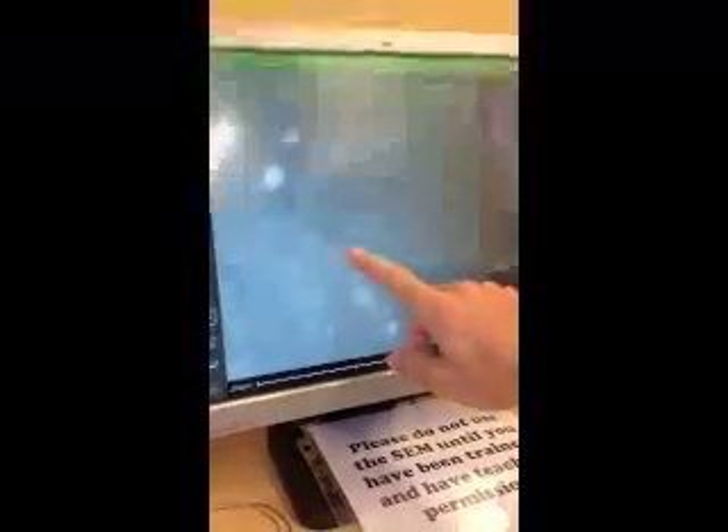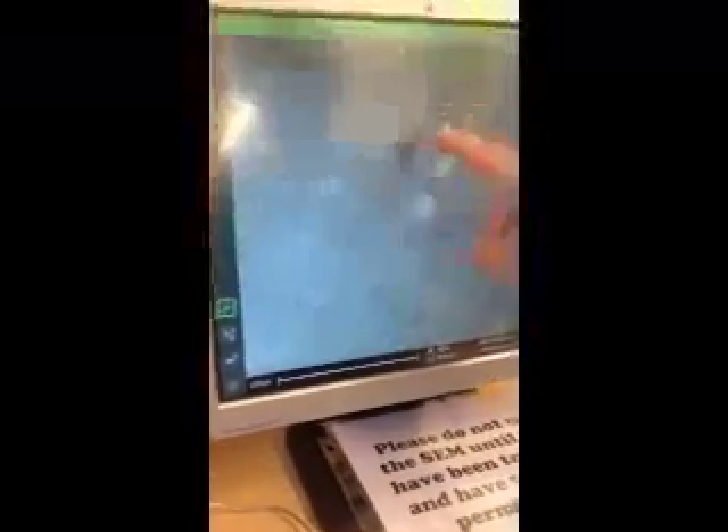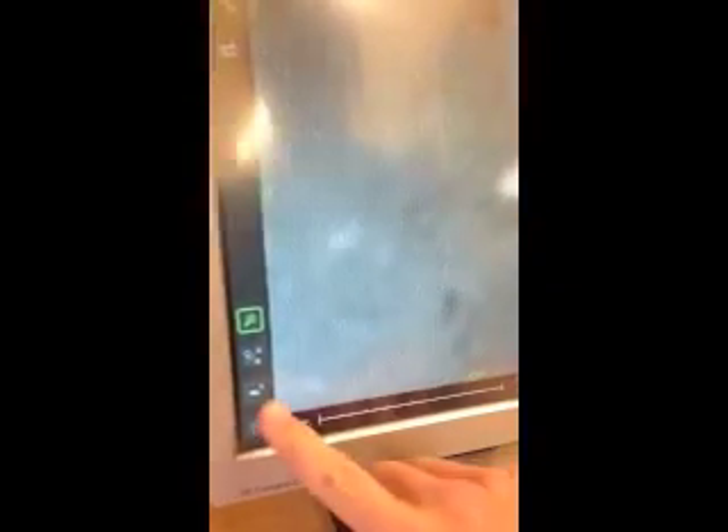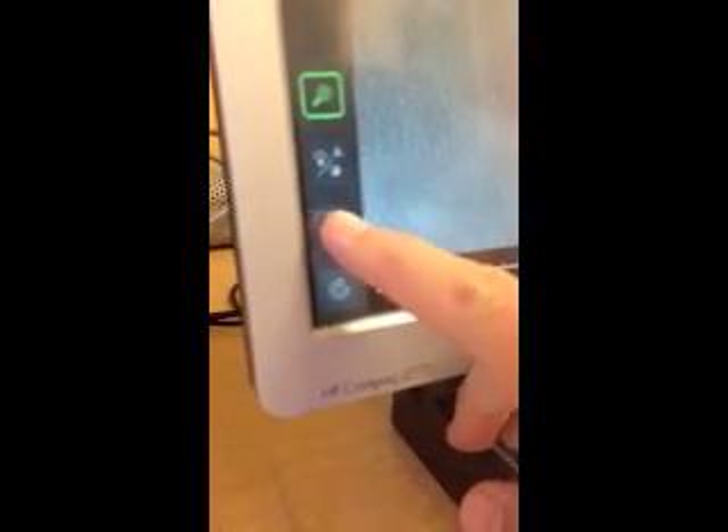And it's this button on the top that looks like a plus sign — and the vacuum begins. Alright, and you are ready to move around your sample. To move around your sample, you can touch it. Do not drag your finger as that does not work. Pick an area that you think is great. You can use this screen down here to get a more zoomed-out view. So this is a pretty bad focus. The focus knob down here with the A is the autofocus — you might have to click that multiple times.